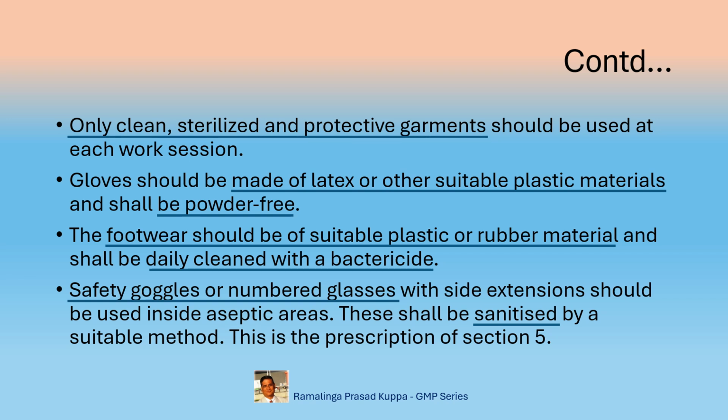Suitable safety goggles should be used. It is recommended to use non-folding type safety goggles. Numbered glasses means power glasses.